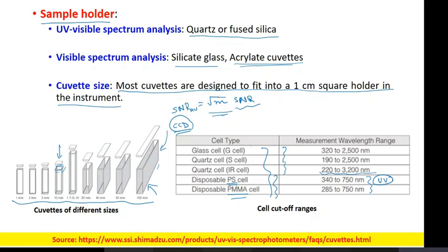Because if you consider this, if you look into the top side, suppose your source is here, so this side and this side are made transparent, and over here you have two sides which are grounded, right? And they are opaque. Am I correct? Yes, sir. So these are done on purpose. The reason being, this side and this side, they are transparent.